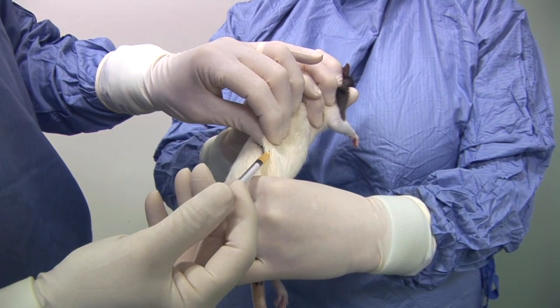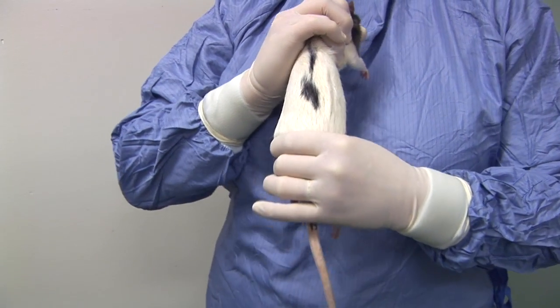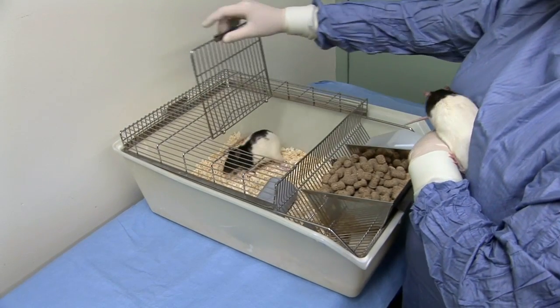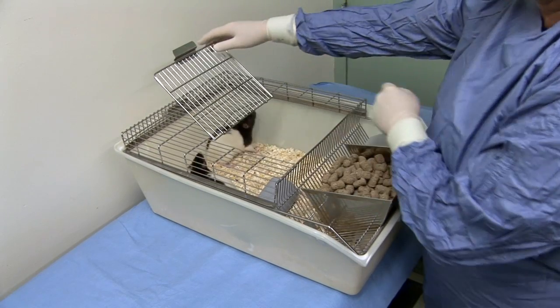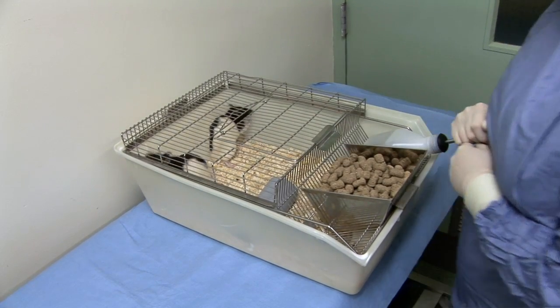The needle is then withdrawn and the rat placed back into its cage and released. Prior to release it may be identified, for example with a tail mark, to confirm that the injection has been administered. When releasing the rat, maintain a secure grip until its feet have made contact with the cage floor, then gently release it.